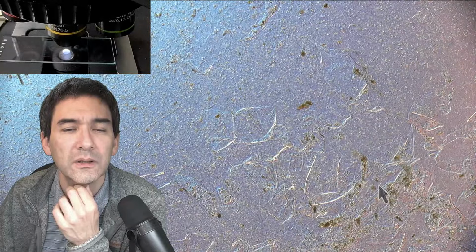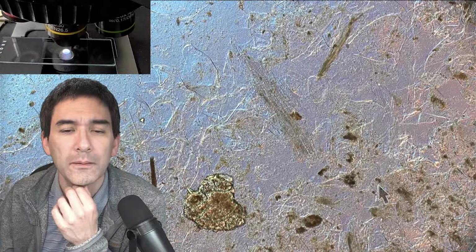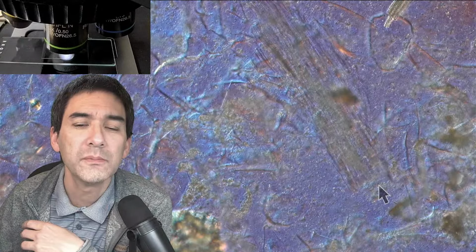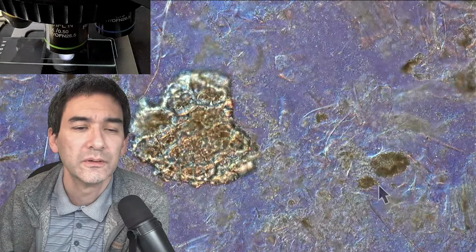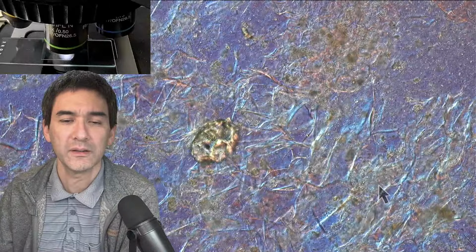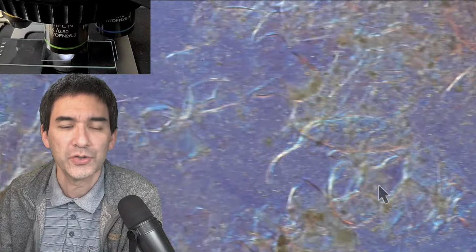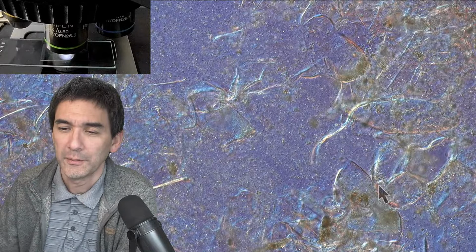Lots of other stuff here. Could this be these long things? Not good enough. This stuff, of course, has been boiled as well. This means that the starch grains of the banana, which is added in here, are also not quite as easily visible, because they absorb the water and they start to become larger and swell up.